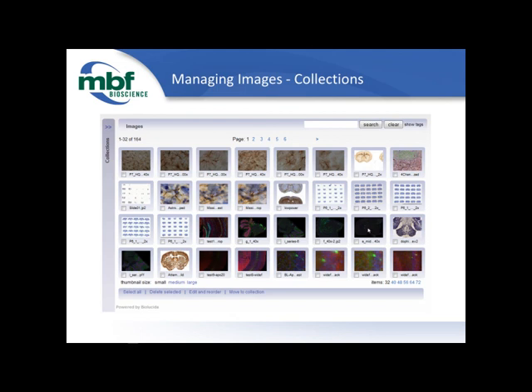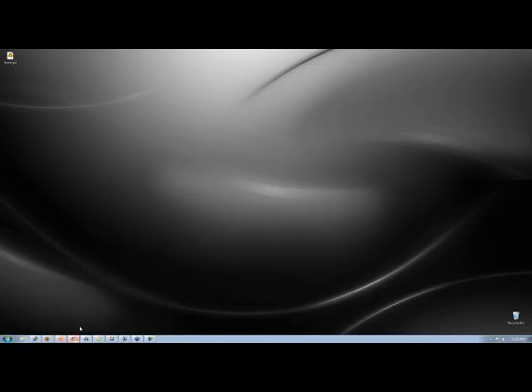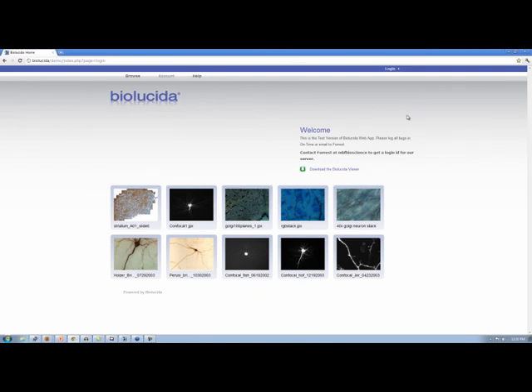And Jeff, let's start by looking at how you can manage large collections of images and how you can organize them into useful categorizations. Okay, not a problem. To demo this, we're actually going to use the Chrome web browser. You can use any web browser you like, but we'll demo it in Chrome. So let's just log in. You could do these similar things in the viewer, but we want to show people multiple ways to do these. I'm going to log in as myself.